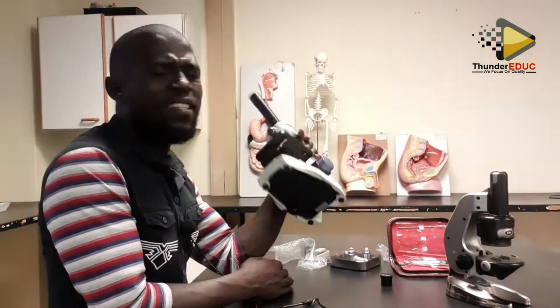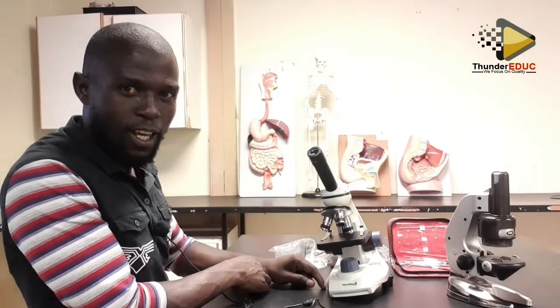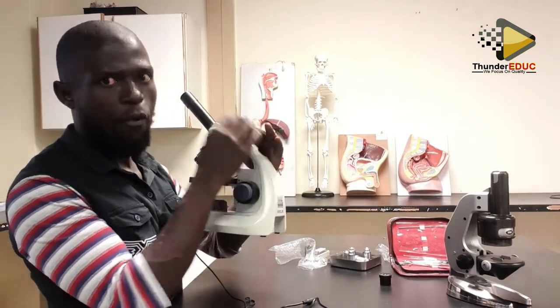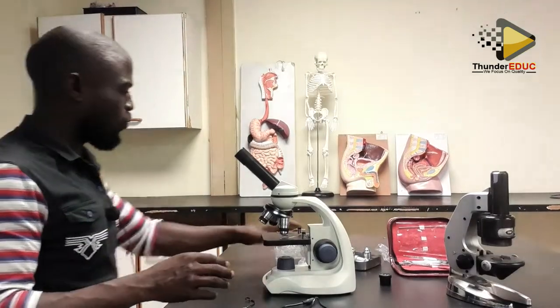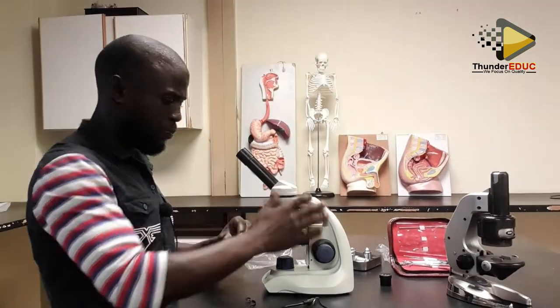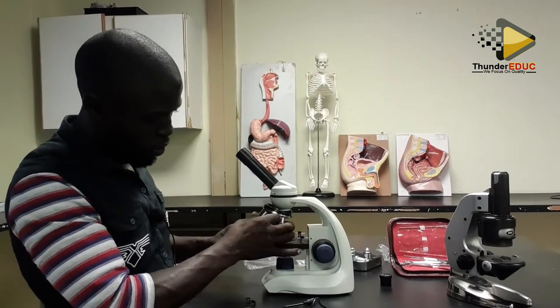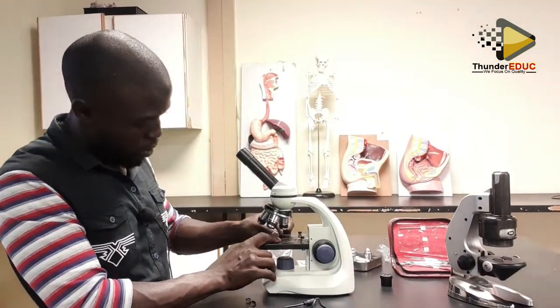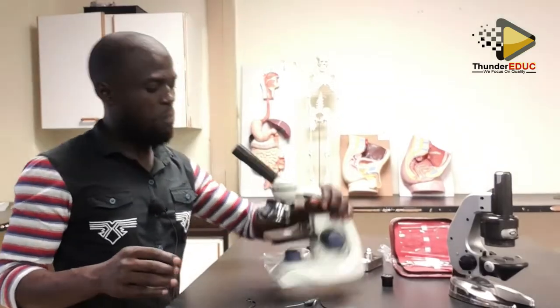This microscope doesn't just stand in air. It has a base, which is where the microscope sits. But if I want to hold it, how will I hold it? It has the arm, for holding and carrying it. Basically, that's it. If you want to put, for example, a slide, you scroll the microscope down, then turn it to the shortest. Then you put the slide there, and you bring these clips and put them on top, and then my slide cannot fall.